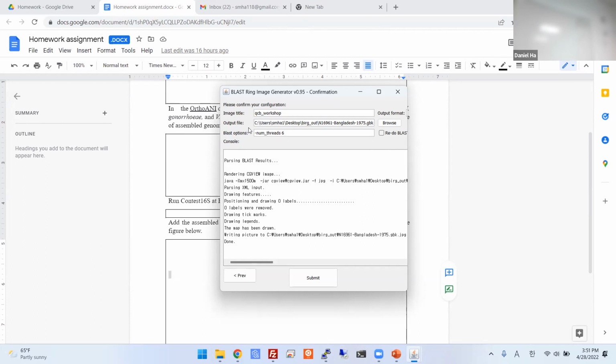Oh, so now you're selecting ring number 1, right? And you select this and add data. So yeah, this is somewhat confusing. Go back to the first one. Yeah, it is added. It's 600. Yeah, and the third one.